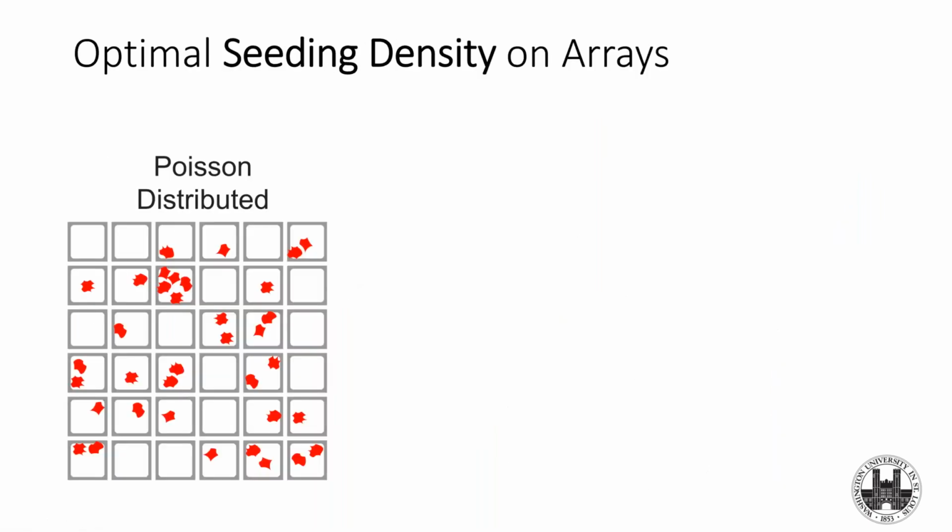One of those things that you can do is to adjust the cells per raft, or what the cell density is. This already works out great. So when you're doing your single cell cloning experiments, you just use a single pipette and you add the cells to the array. And of course, they're going to distribute themselves in a Poisson distribution, right, just randomly. And so for the single cell pipeline, that works great because you basically add a third of the cells, so your ratio of cells to Rafts is about 1 to 3. And it doesn't look like this. It would look much sparser. And that's actually perfect for doing your single cell pipeline.